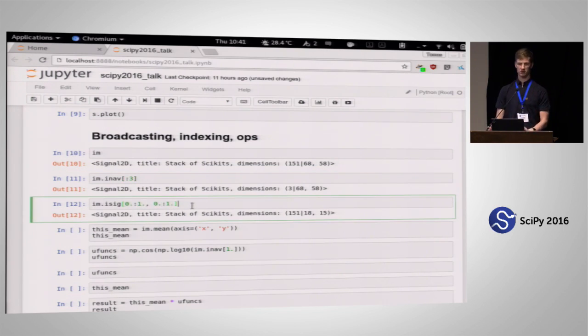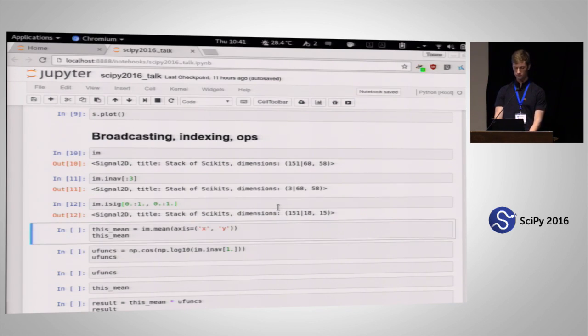And you can mix and match. You can specify the start in indices, the end in floats, then the step in indices again, and it doesn't really matter. That's very useful when you actually have physical data that is important. So you want to select that particular micron, and it's very useful.